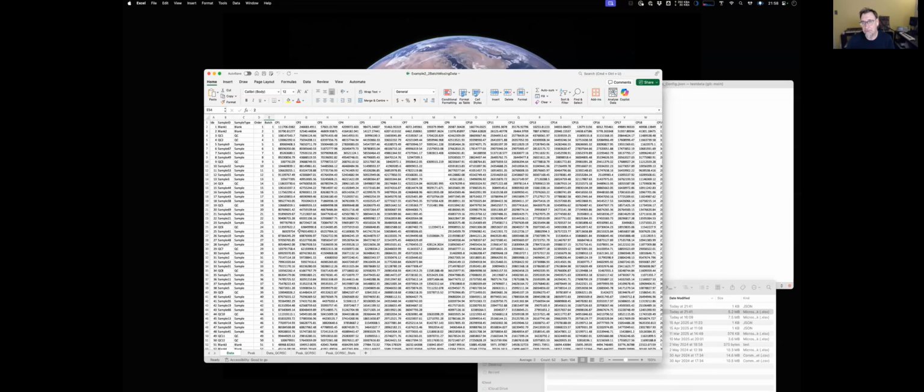But I would say as a minimum, you would want to have a QC at the start and the end, and then 3 QCs within the batch. And if it's that small, you're only going to be able to use the linear correction. The algorithm will tell you if you've got too few data to do a nonlinear correction, and it will automatically default to the linear. But realistically, if you're doing a very small study, the likelihood of you having a nonlinear drift is a lot smaller.